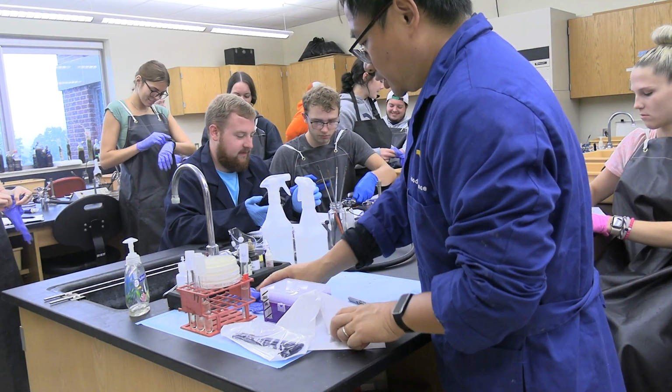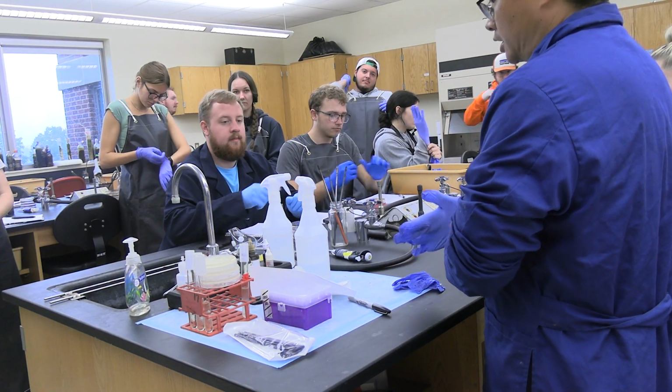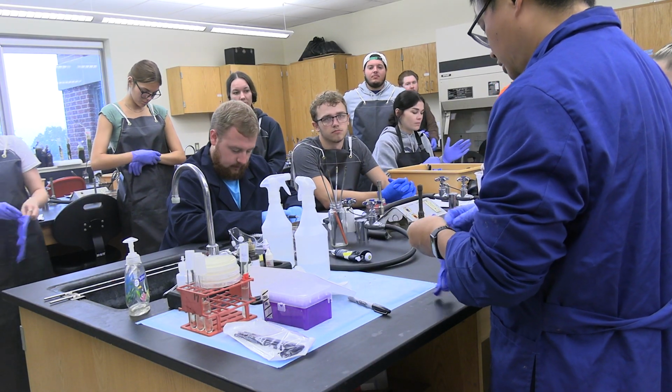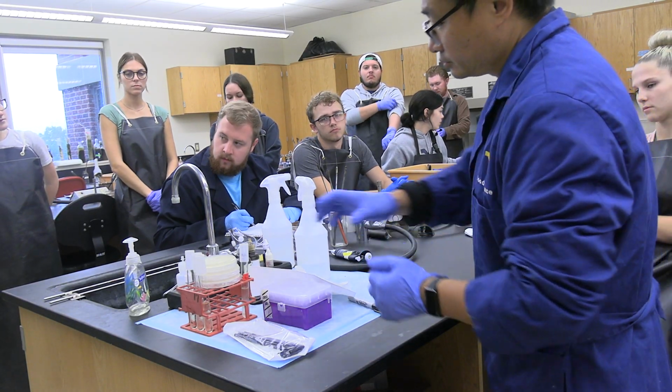So we're going to do a spread plating. This is basically a new thing to you guys, and we have lots of material, generally speaking, compared to what we did before. So let's do it step by step.